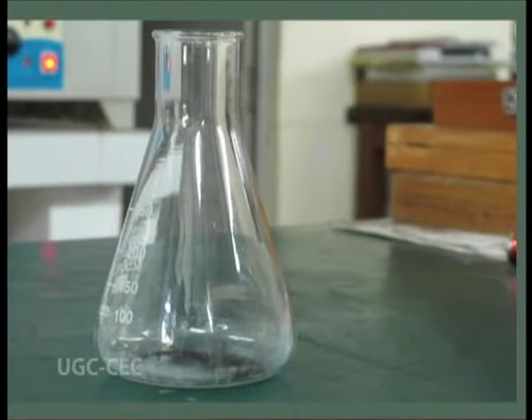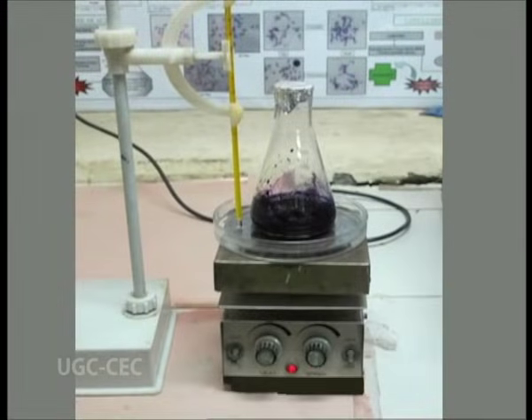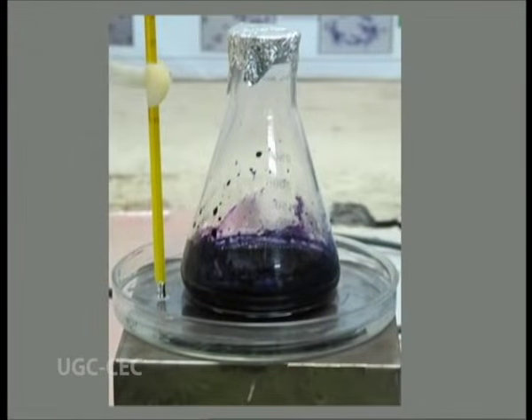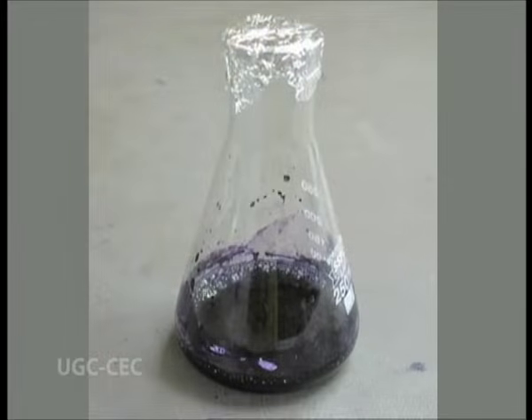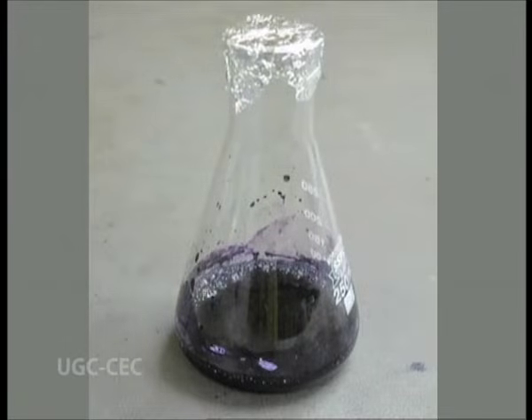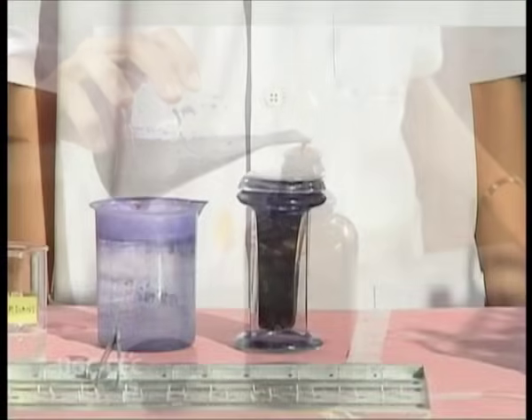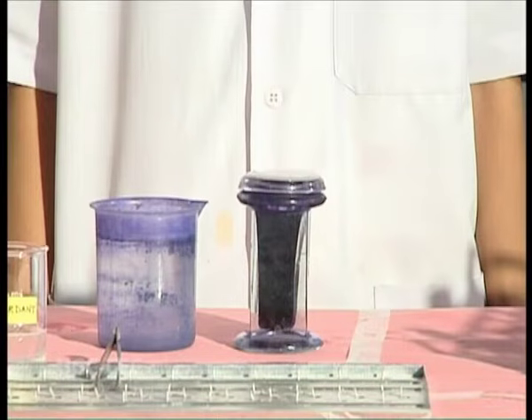For the Giemsa stock solution, take 1 gram Giemsa powder in 54 ml glycerol, stir and heat at 60 degrees centigrade for 1 hour. Cool and add 86 ml methanol to it and put the solution overnight in the dark. Next day, pour the solution in an amber colored bottle. Now, to prepare the working solution, 1 ml of the stock solution is taken in 50 ml distilled water to get 2% Giemsa stain.